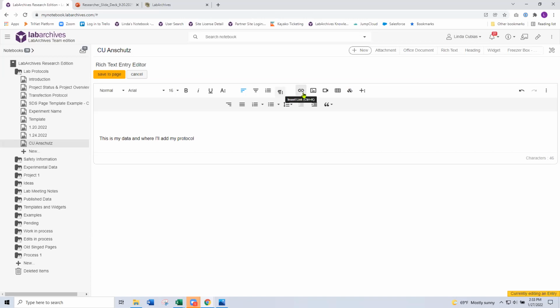In a moment, I'm going to talk about uploading attachments, okay? But there could be opportunities where you don't want to upload the data to LabArchives, you want to link to the data. Maybe you have some data in another service, in REDCap or some other repository that has a persistent URL. Put that URL into LabArchives, and then you could link out to that service or resource.